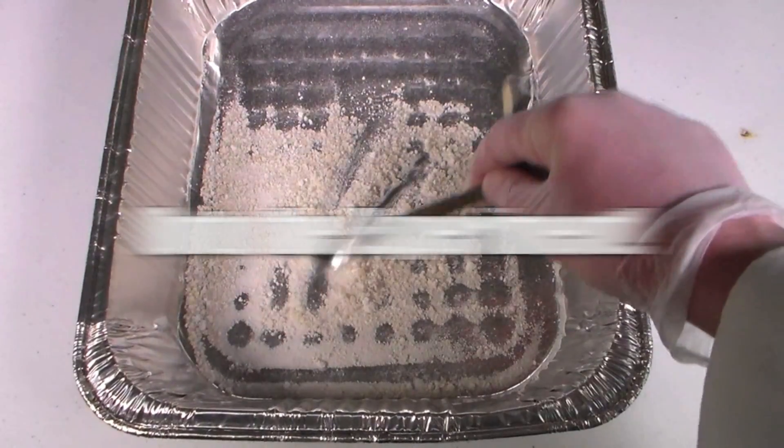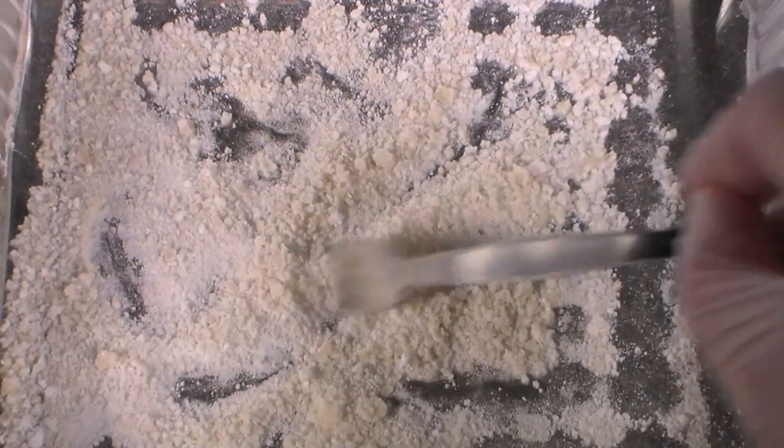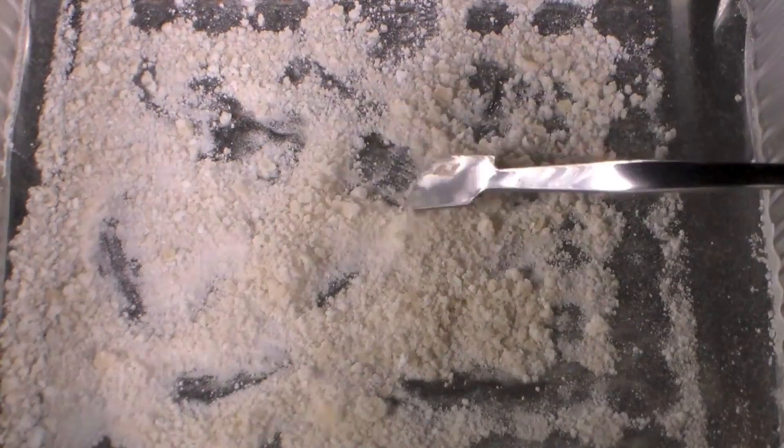Anyway, let's get on to the experiment. Aluminum oxide is a useful catalyst and I will be using it in a future video to catalyze the dehydration of ethanol.